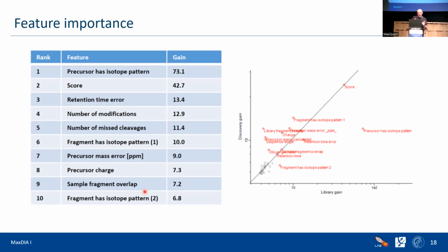as many amino acids as you like in the middle between the Y and B series at the beginning and end. In particular, this is even worse in DIA, because in DIA you don't have this fixed role between the precursor and the fragments, which in DDA you get naturally by selecting the precursor for fragmentation. In DIA you have to be super careful that you assign the correct precursor to your fragments in the data, and if not, you might get a completely different peptide identified.